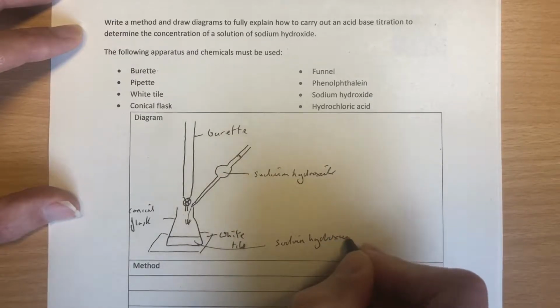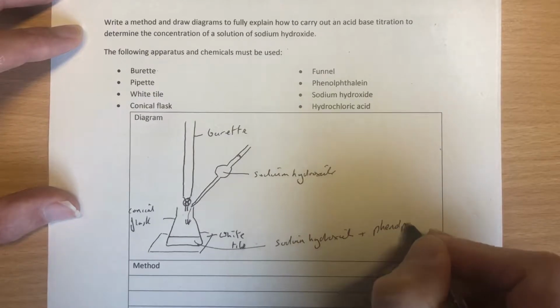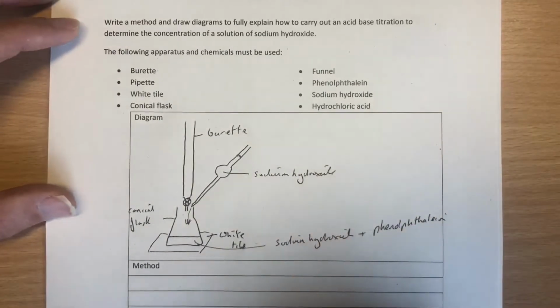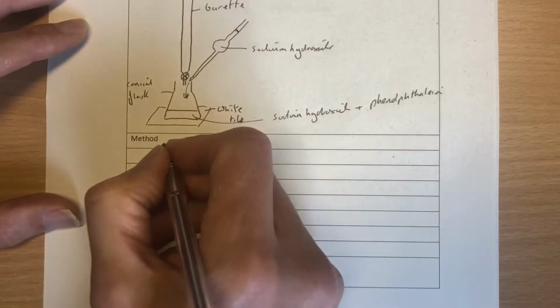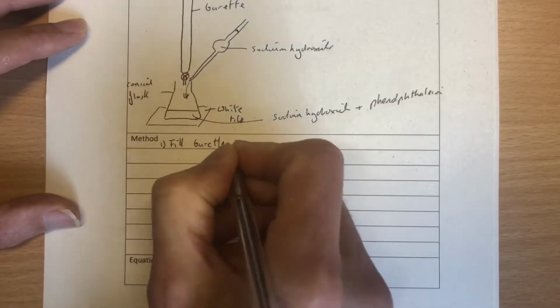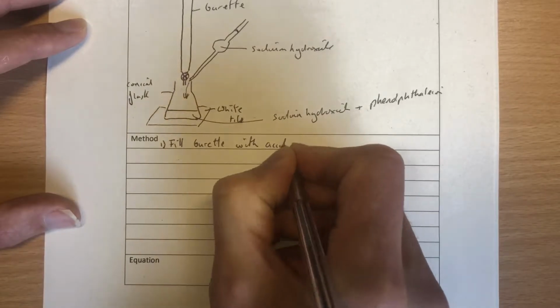Also in here, we will have our sodium hydroxide, which we've measured out with the pipette, but we will also add to that phenolphthalein indicator, which will turn pink in the alkali. So that's the apparatus. Now the method. So we'll quickly write that down there. I shall bullet point this up. 1. Fill burette with acid. 2.